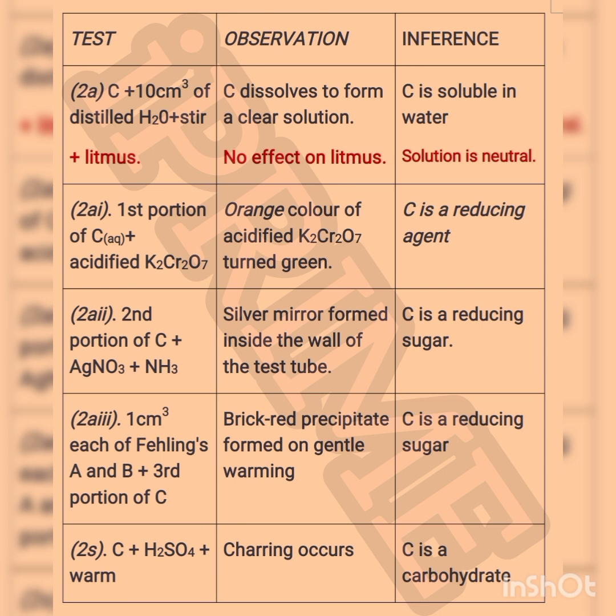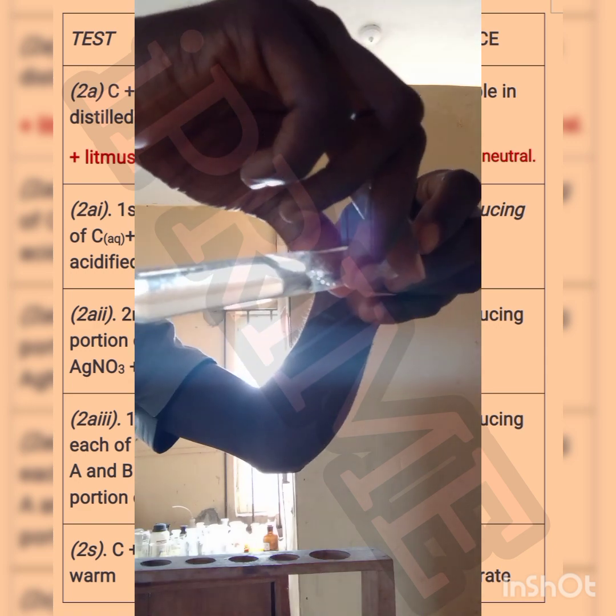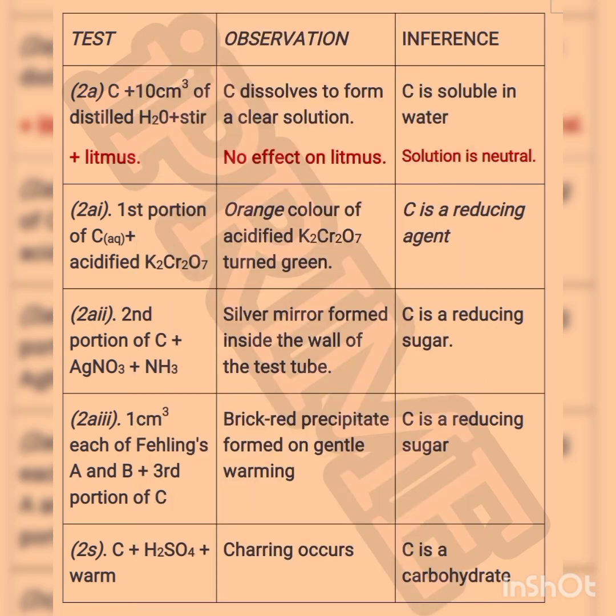Okay, we are yet to finish with that. Under that same 2A, you are asked to test the resulting solution with litmus paper. And bear in mind that when you are testing with litmus paper, you test with both blue and red litmus paper. So on testing the solution, at the left hand side we have plus litmus. You record the observation for that one separately.